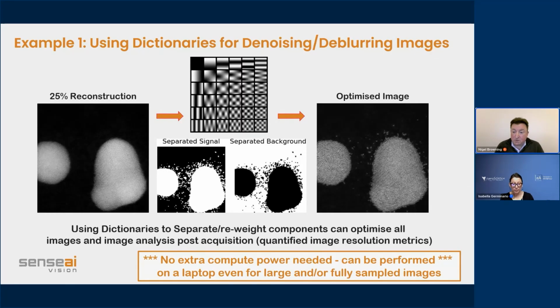And the deblurring is also important because always when you try and denoise, the way denoising works is it blurs out the image because you get rid of some of the high spatial resolution data. By denoising and deblurring together, you preserve that information. And that's very important for reconstruction of images. Next slide, please.